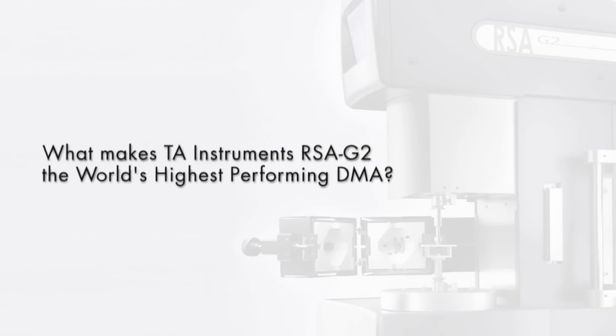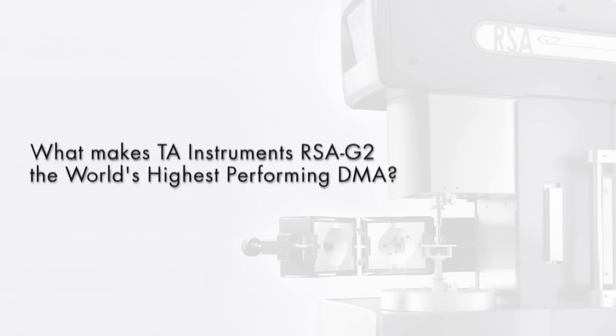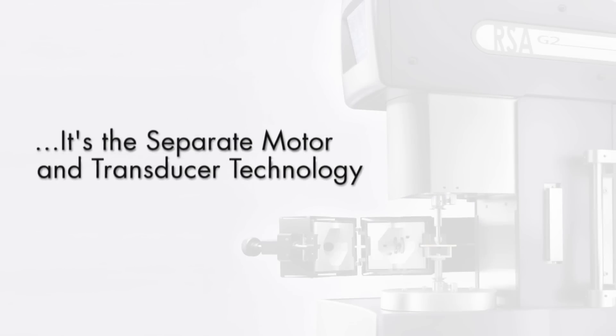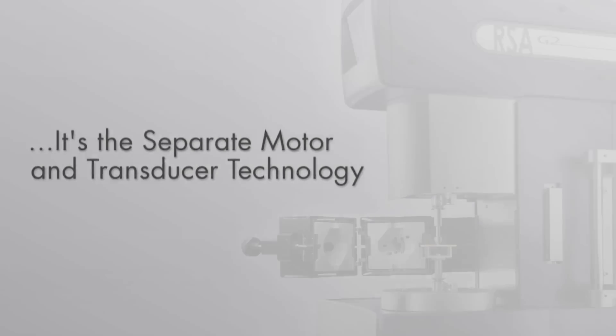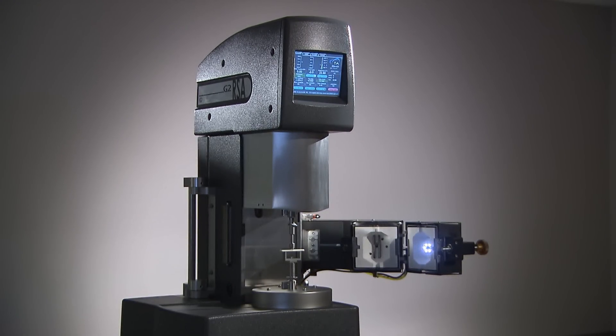What makes TA Instruments RSA-G2 the world's highest performing DMA? The mechanical behavior of solids is described by material functions such as the modulus, defined as the ratio of stress to strain.